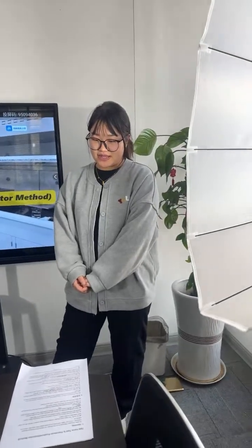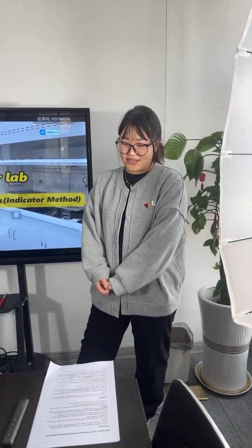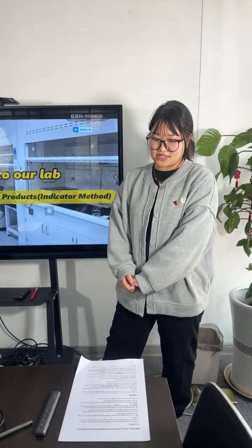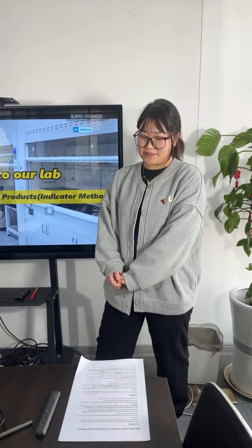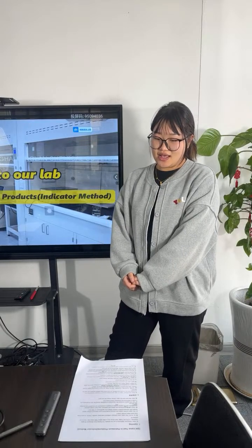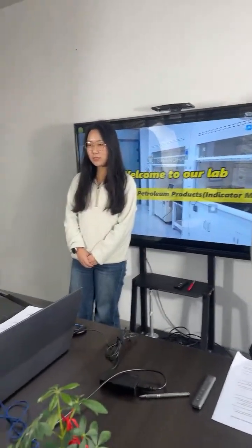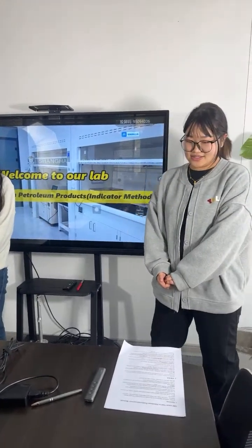So what's the significance of the TBN test? When petroleum products are added with additive, they may contain alkaline components, and the relative content of alkaline components can be determined by acid titration. Yes, it's used to measure the degradation of additives during the use of lubricating oil in order to determine the necessary actual waste limit. Now let's see the video.